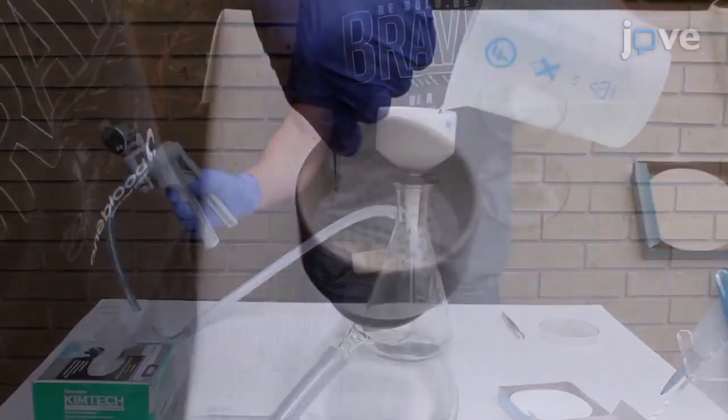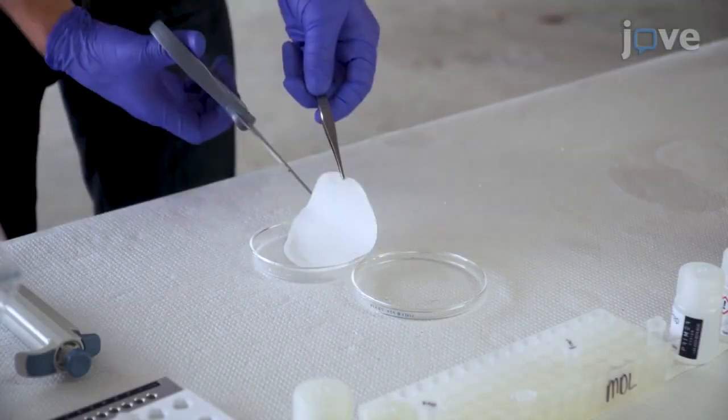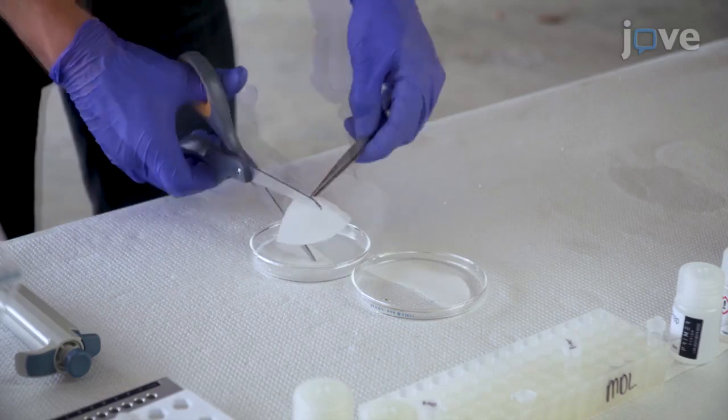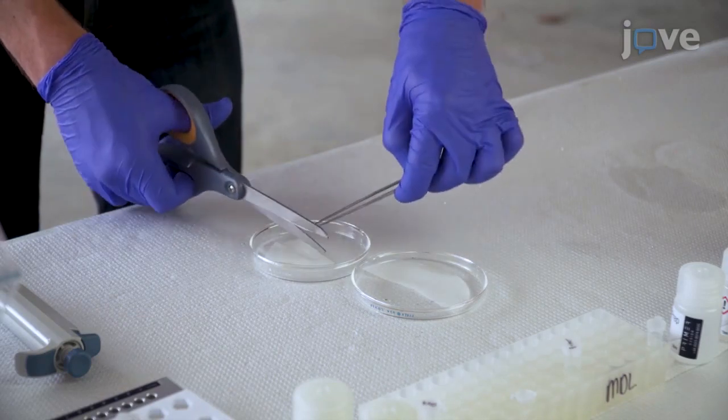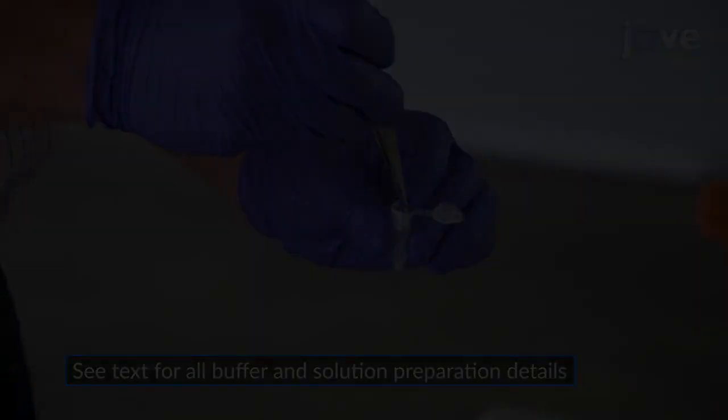When all of the water has been filtered, use forceps to remove the filter paper from the funnel and use sterile scissors to cut the paper into small pieces. Submerge 8 to 12 pieces of paper in 400 microliters of extraction buffer.